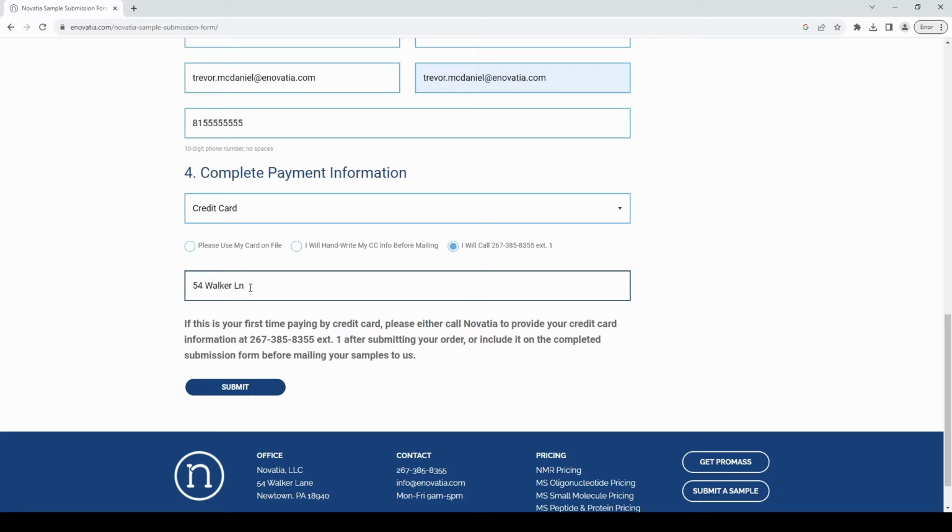If there is an issue with our submission process, if something is incorrect, such as we did not fill out something correctly or our Excel sheet is the incorrect version, this page will refresh and bring us to the top of the page, and there will be an indication that there is an issue with this page. If there are no issues, we will see the confirmation page for our submission. So let's go ahead and press submit.